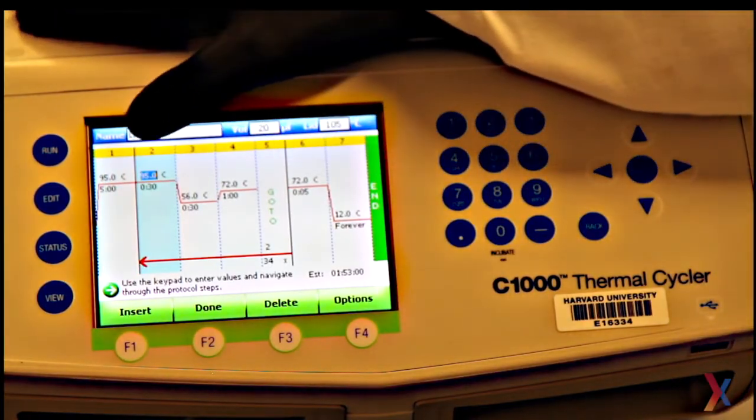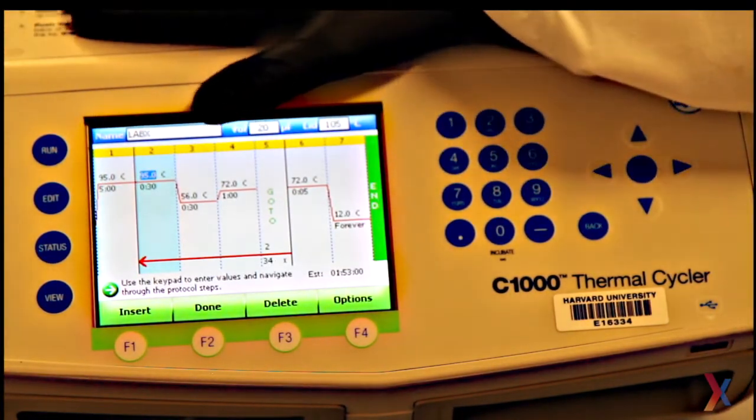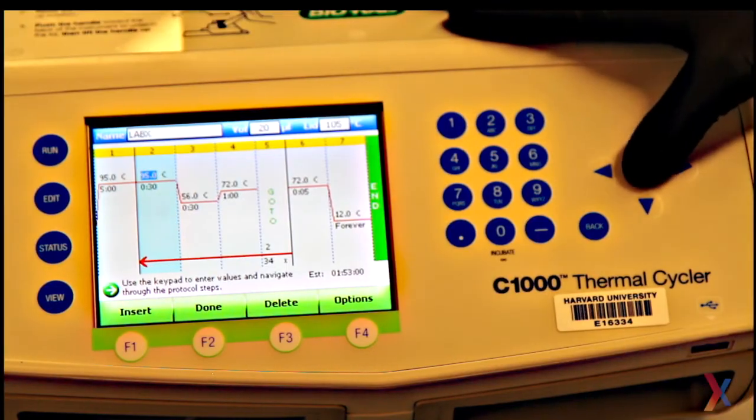Next is the denaturation step within each cycle. I want this at 95 Celsius again for 30 seconds.